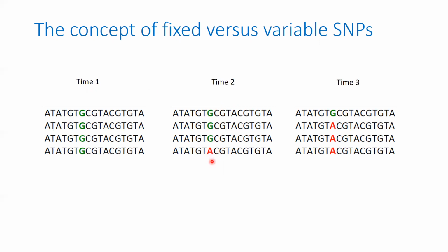But definitely, this is still a minority of our reads. Once we come later in the treatment and we sequence, we see that this allele starts taking over the population, and in reality, the susceptible allele is now the minority.